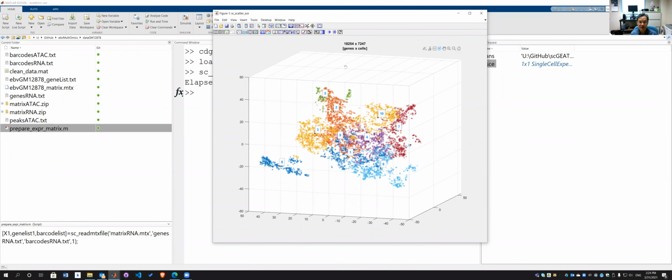So I want to make some adjustment. What I can do is to brush. I want to select this brush and brush over these cells. So I brush some of these cells in cluster 3, some in cluster 8. Make sure you have at least one cell in that group, one cell in that group. The reason is I'm going to merge them. Not a good idea. I shouldn't merge them. Let's see. What should I do?